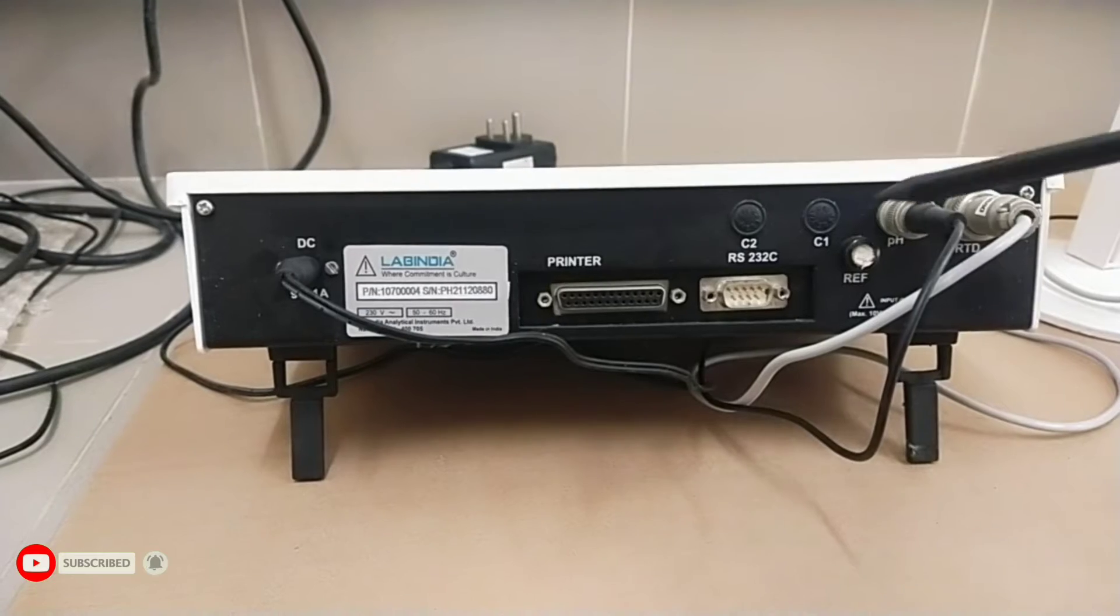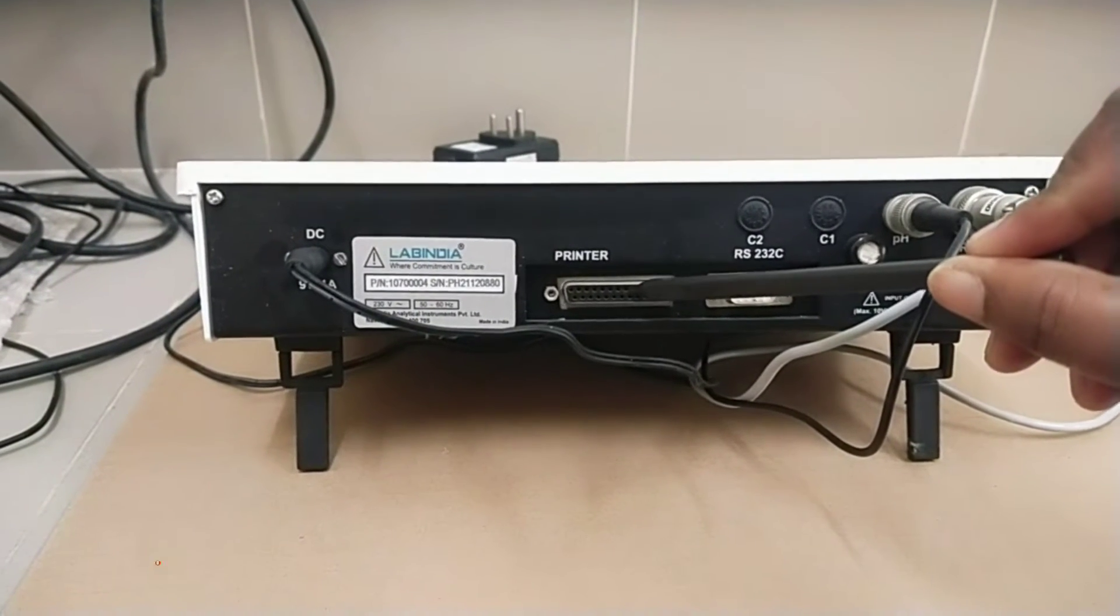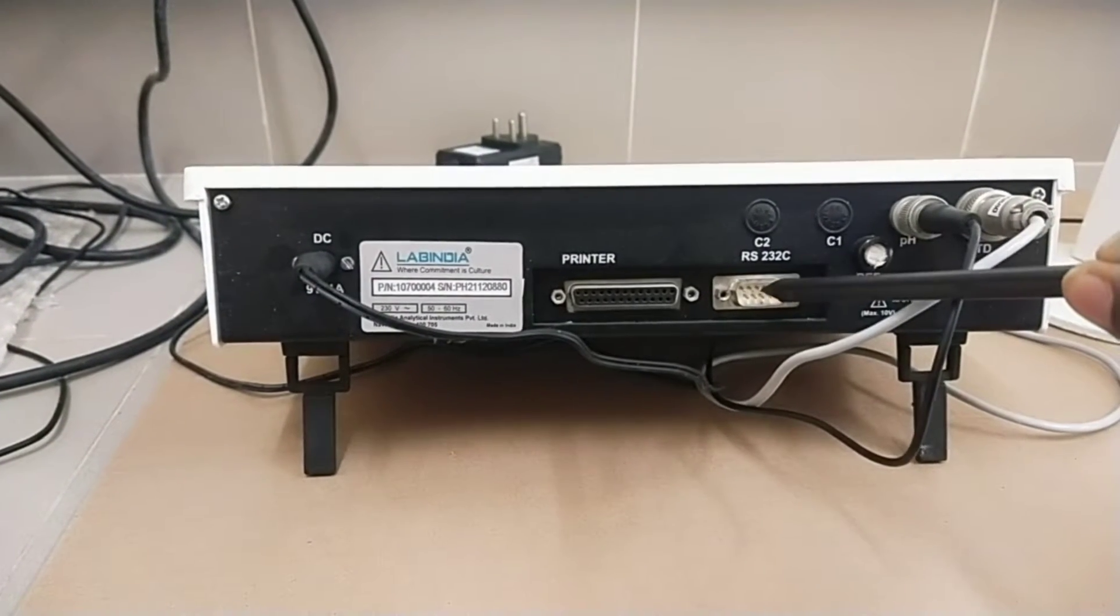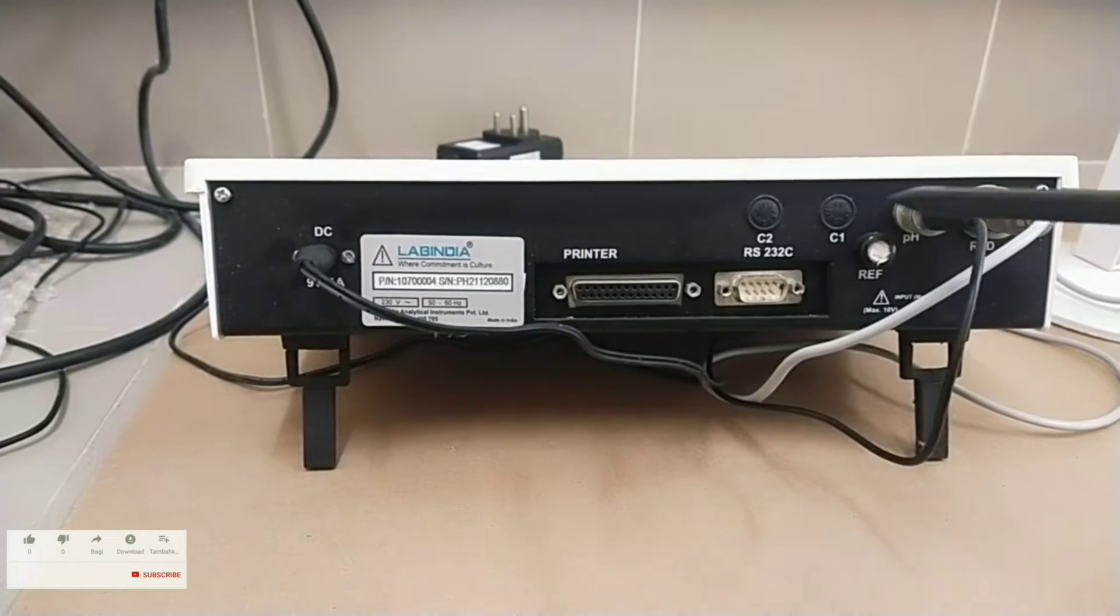Connector for printer. Connector for PC interface. Socket for reference pH electrode.